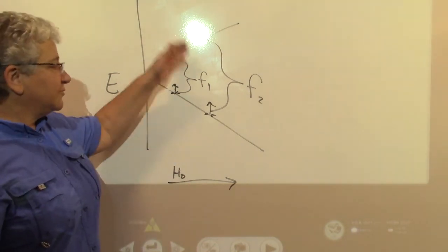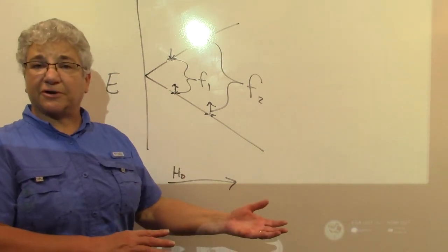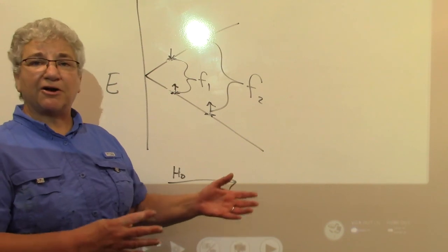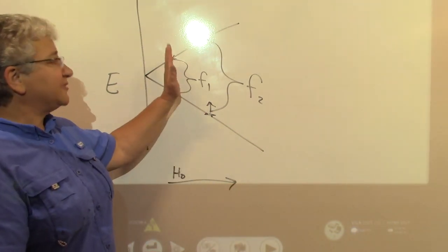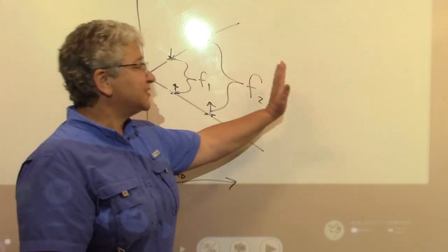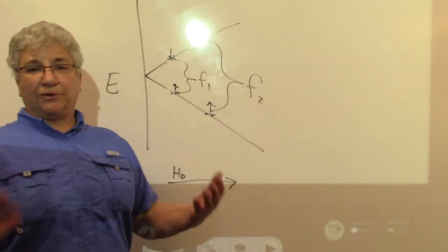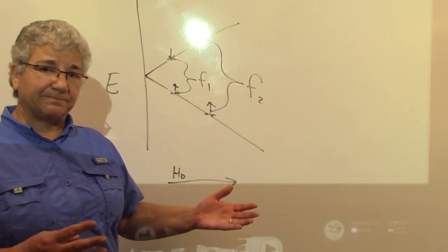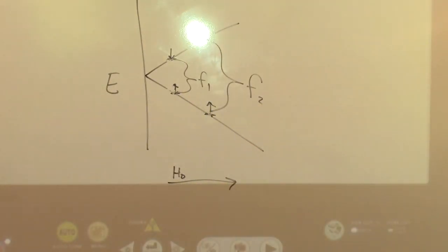Okay? So what we're looking at when we ultimately look at a spectrum is what frequencies were absorbed by our molecule. You're going to see peaks that represent this frequency and this frequency and this frequency, and whatever frequencies your molecule happened to need in order to spin flip. And that's what you're going to see on your NMR spectrum. And that's all the theory that we are going to cover at this point.